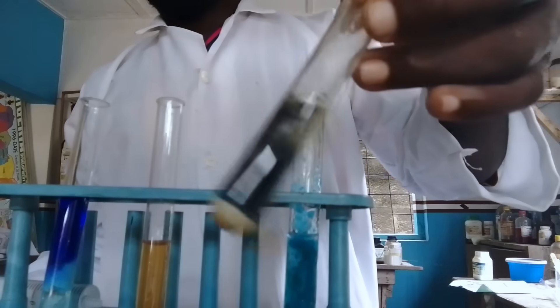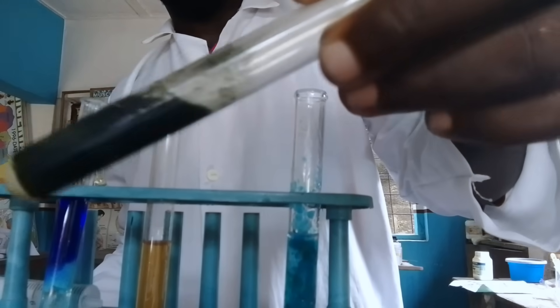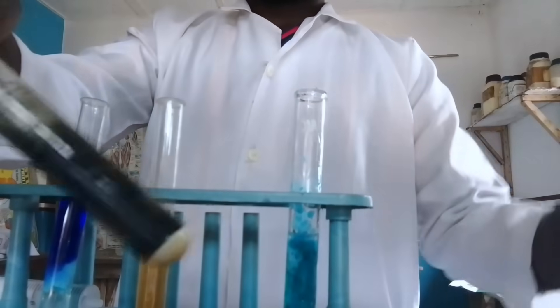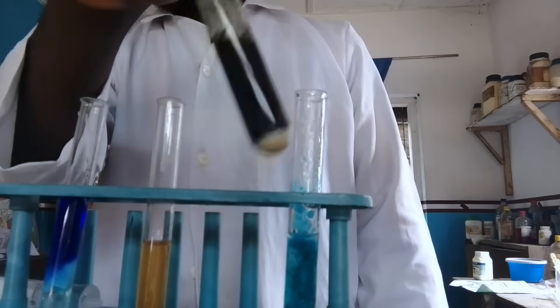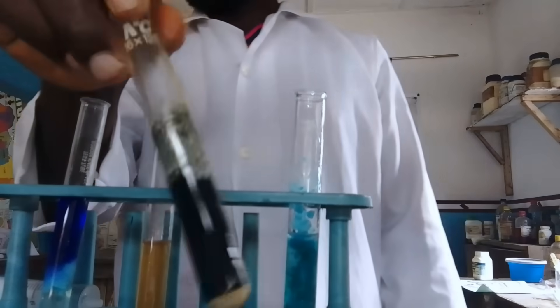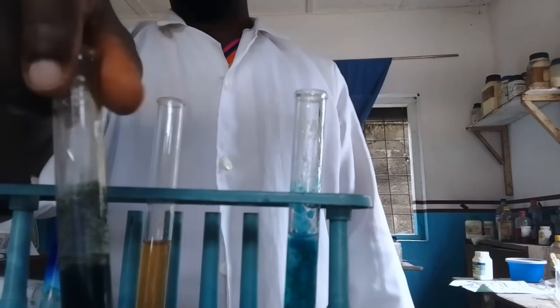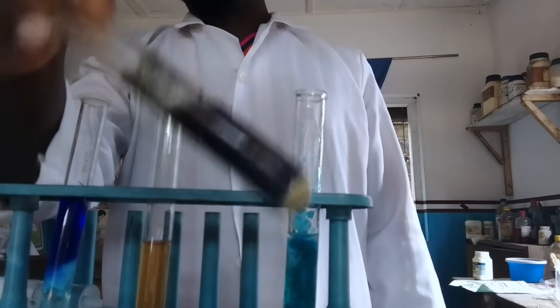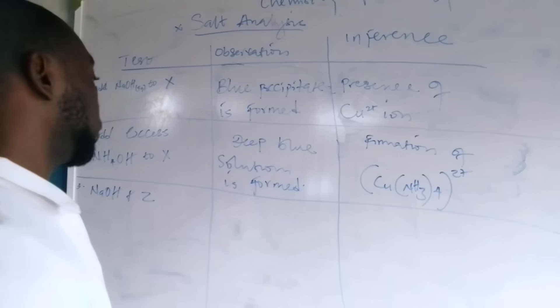Now if you look at it very well, it is greenish in color and it looks dirty. So the observation is: dirty green precipitate is formed. Under the inference: iron two ion — Fe²⁺ — is present.